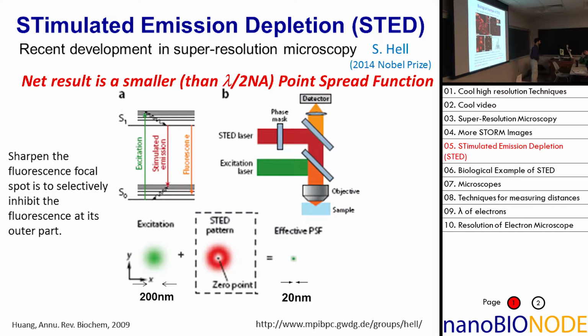I just want to make sure I get it. Will you explain one more time really quickly how you get the really tiny dot? Okay. Go ahead, you explain it to me. So there's the original excitation band that you have, that's the green thing, and then you get that donut pattern which you explained, and then they interfere, and you only get the dot in the middle. Is that what happens? I feel like no, because of that silence. What do people think?